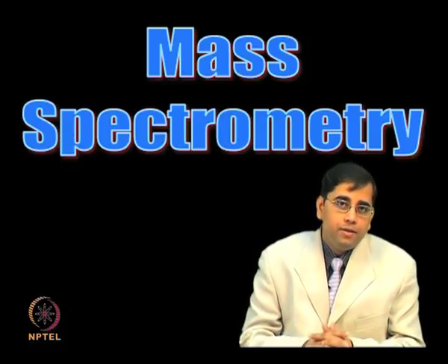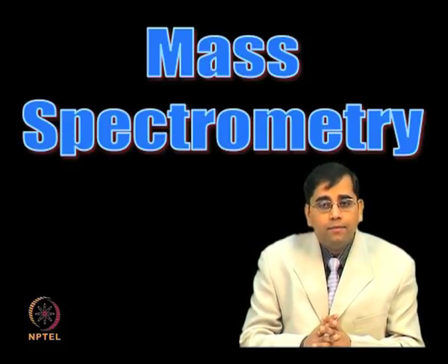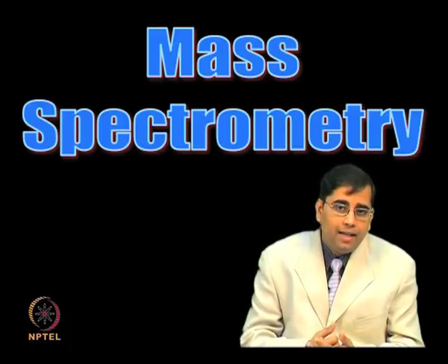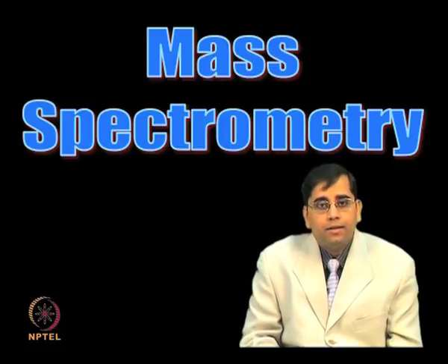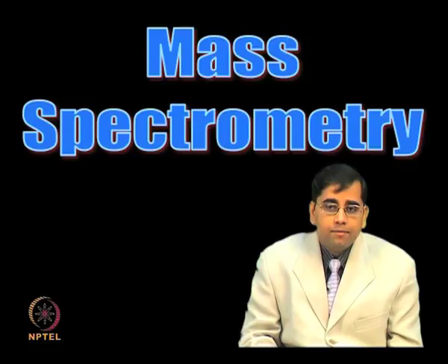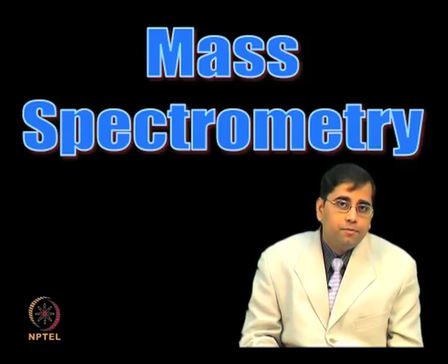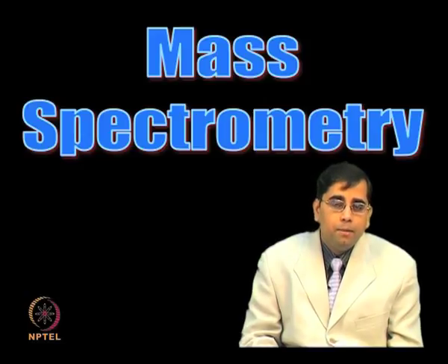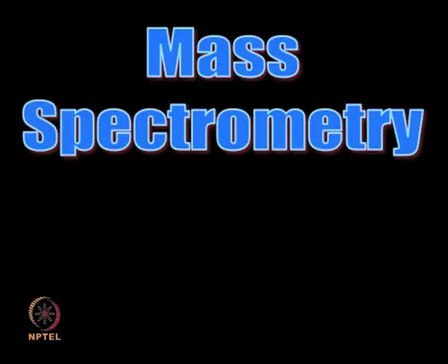and in biology in general. It offers high throughput, sensitive and specific analysis for many applications. In this module, we will discuss basic concepts of mass spectrometry, ionization sources, mass analyzers, hybrid MS configurations and quantitative proteomic techniques such as SILAC and iTRAQ.